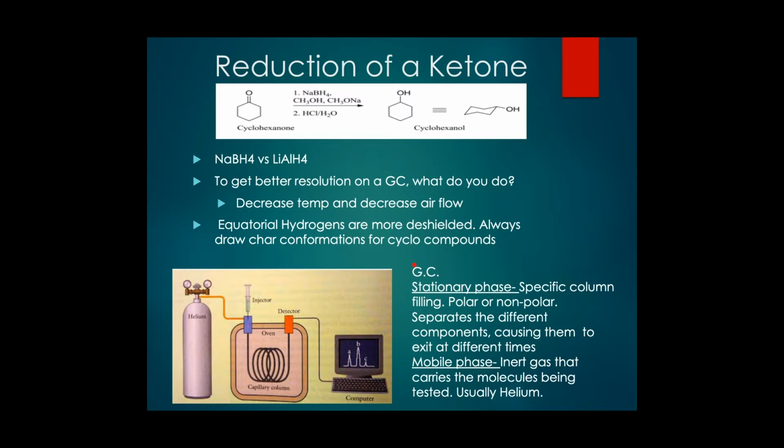We are not actually going to be using this in lab, but we will explain it, and you should be able to do a simple calculation from information given to you from a gas chromatography reading. Essentially, a gas chromatography machine helps us separate and analyze our compounds. With it, we can understand how much of our product we actually have compared to contaminants.